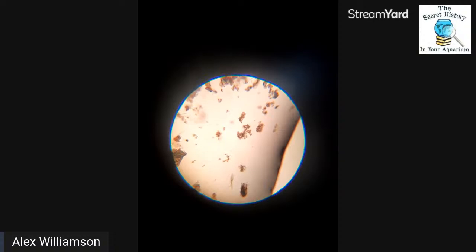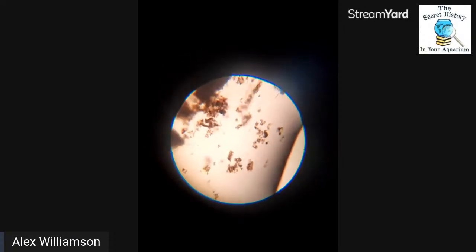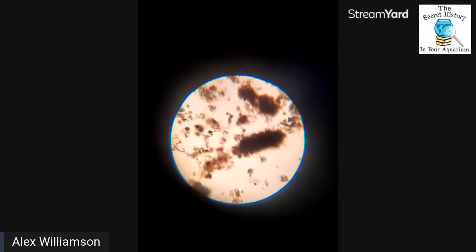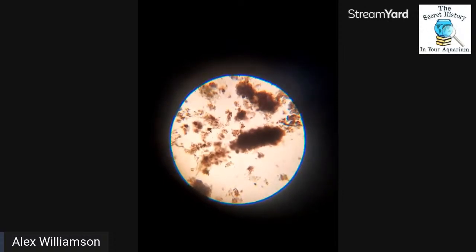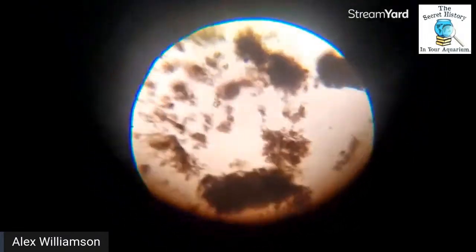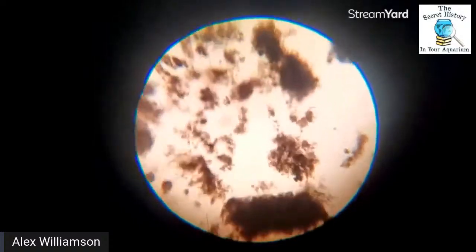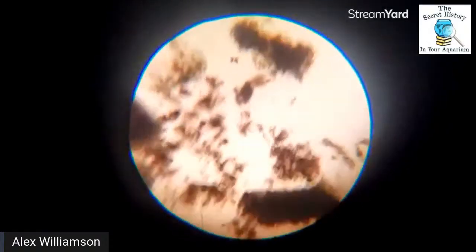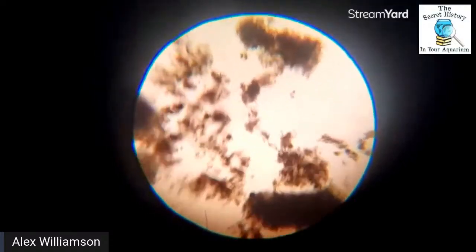So let's see what we can see. We'll start off, right now we're at 10 times magnification. And let's see here. I feel like if we turn the camera, let's see if it flips it. There we go. Is that better for y'all? Let me set up a tripod if that is better. It's better for me. It makes it double the size. So I don't really care about y'all. I'll make it bigger for me if no one else.